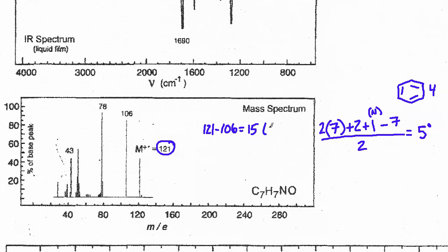Well, 15 is most commonly a methyl group. Okay? So there are fragments, and this is the mass of a methyl group, 15. Right, there are fragments that are very common that show up again and again with certain numbers. And again, if you get the guide, I have documented all of that in there. There's a table in one of the appendices that gives all the most common fragmentation patterns. It's a very useful reference guide when you're going through this.